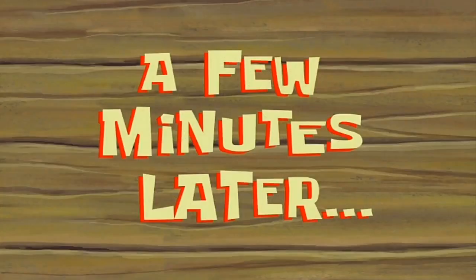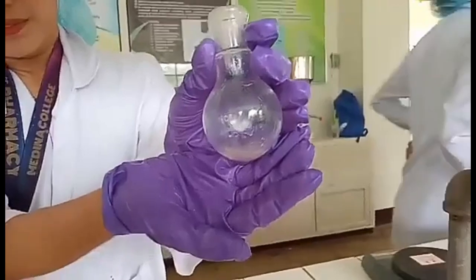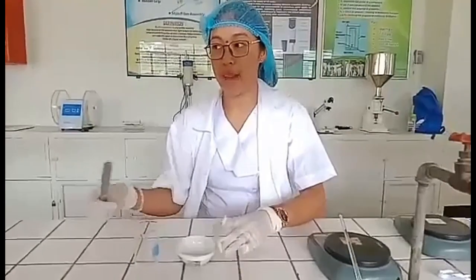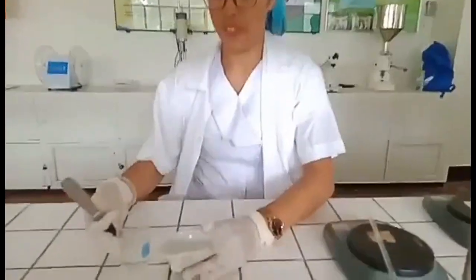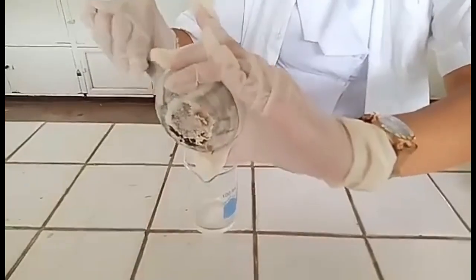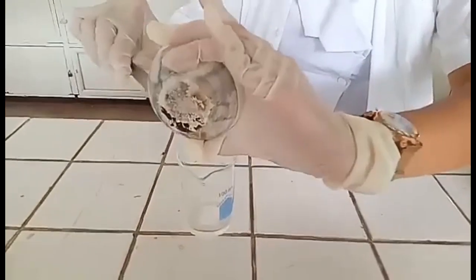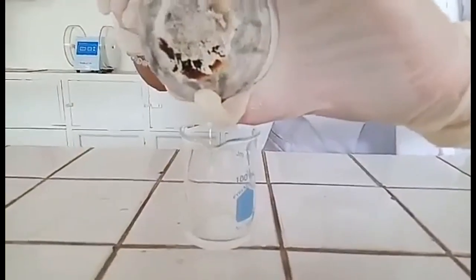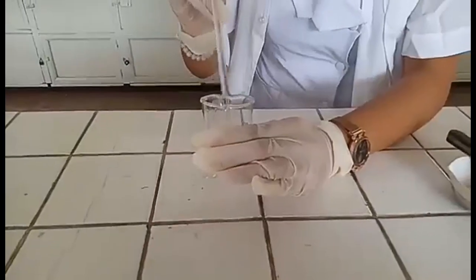A few minutes later, prepare 0.8 g of sodium chloride in 3 ml of water, to be used later in the transfer of the mixture.